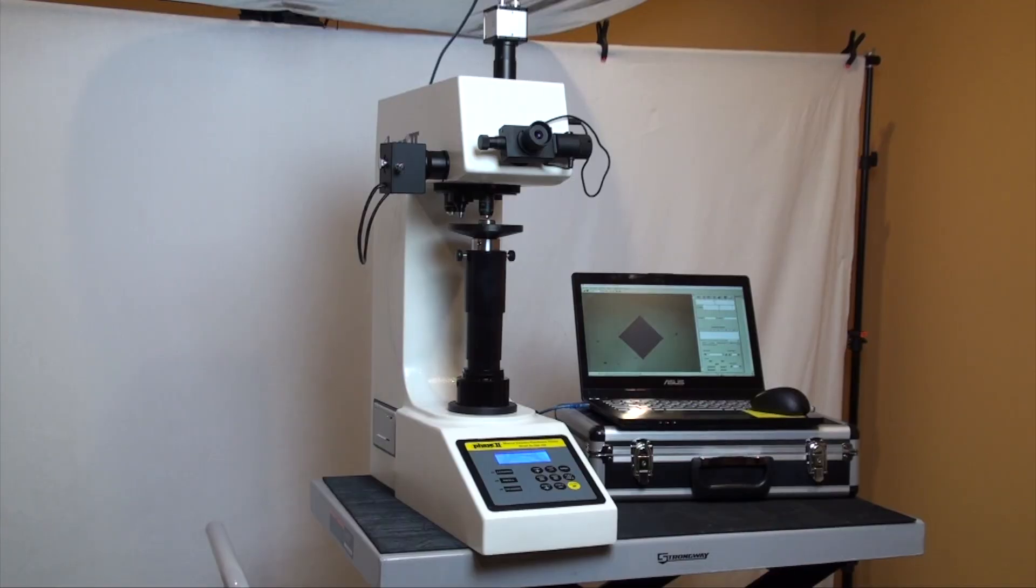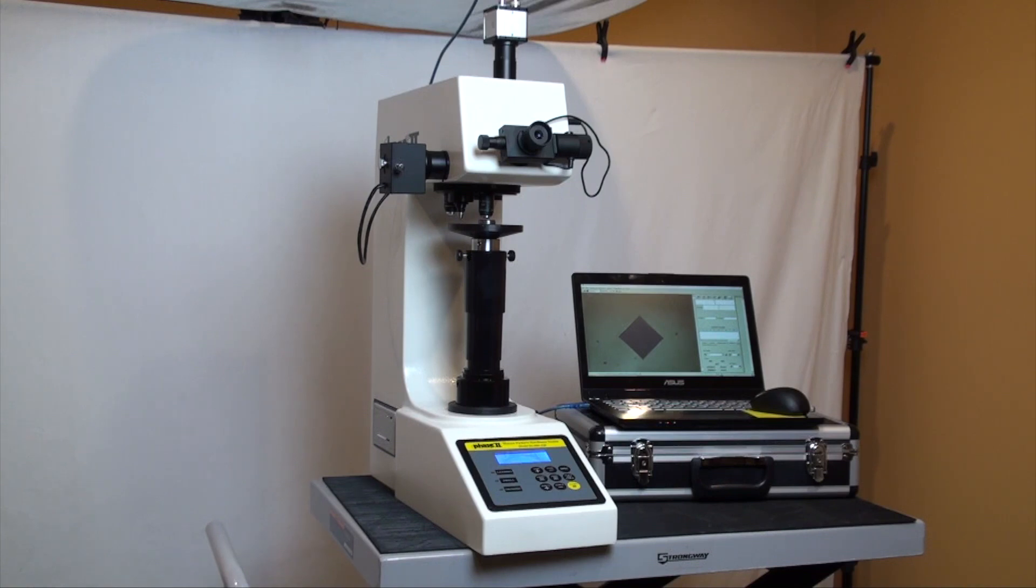This is an instructional video detailing the applications and functions of the Phase 2 Digital Macro Vickers Hardness Tester with Manual Turret.